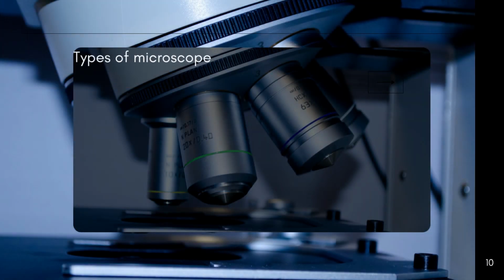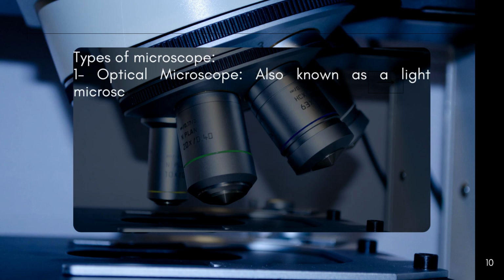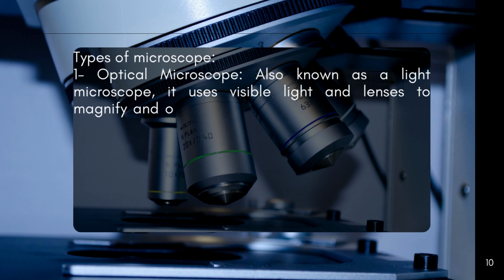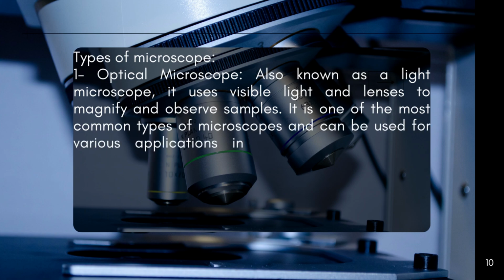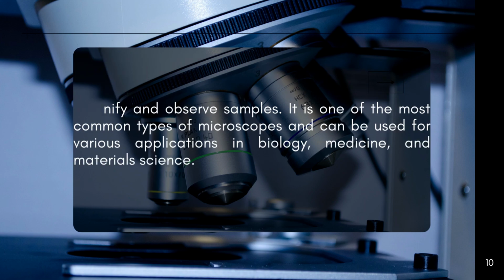Types of microscope. Optical microscope, also known as a light microscope, uses visible light and lenses to magnify and observe samples. It is one of the most common types of microscopes and can be used for various applications in biology, medicine, and materials science.